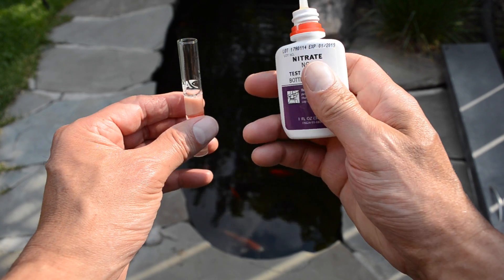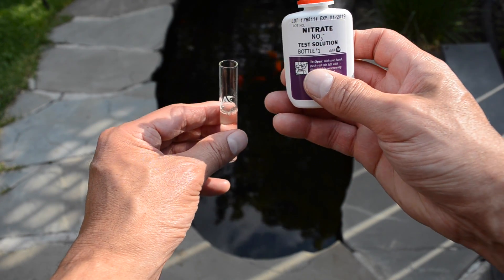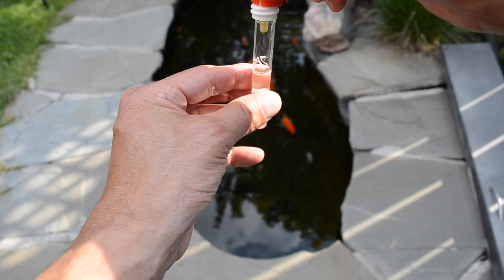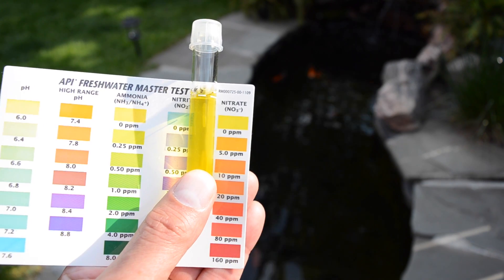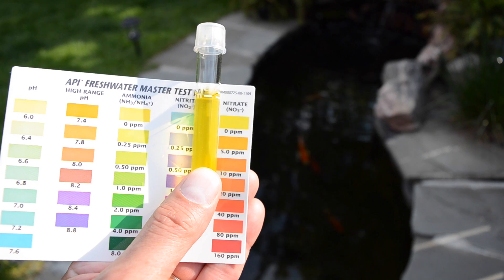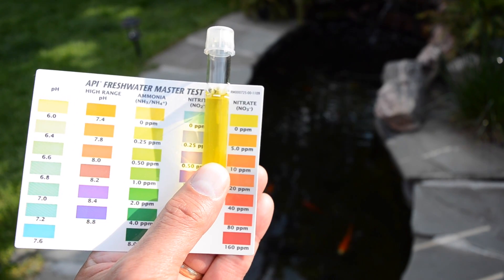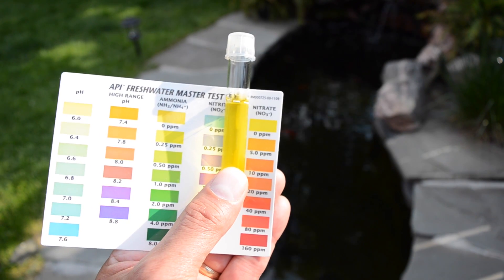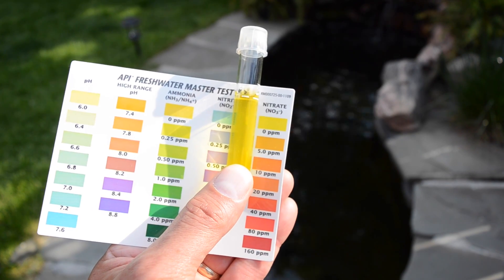Now we're going to test the nitrate level — adding five milliliters to the test tube. This is our last test today. It's sat for about five minutes and you can see we appear to be getting a very good reading on this one as well. It looks pretty much the same yellow as on the chart, so I would call that zero parts per million in the nitrate zone as well. Quite pleased with all those results today.